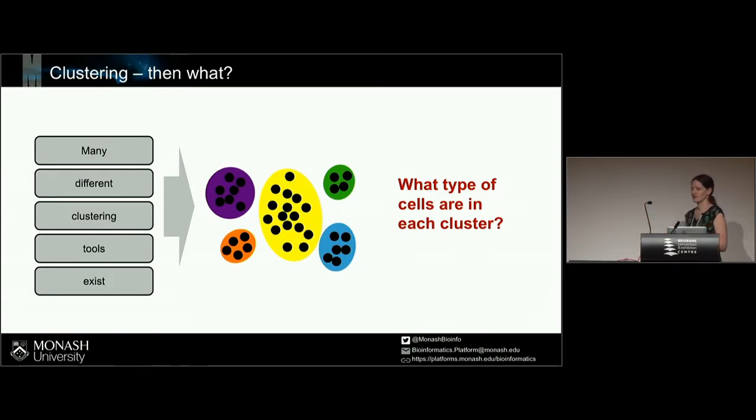This actually came out of sitting around in a meeting, looking at a new single cell data set, going, this is really interesting. Where are the oocytes? Is it this group? What's that group? Oh, that's immune cells, don't care about those. Just trying to figure out what's what, so that you can then get on to the next stage, which is looking at the biological question.